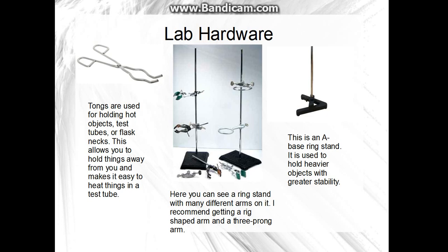Now onto the hardware. You need a pair of tongs — they're used for holding hot objects or test tubes over an open flame to heat things. You need a ring stand; two is better than one, but I only have one. You'll also need arms for it — I prefer just the ring arm. You can also get a two-prong or three-prong arm. An A-base ring stand is used for heavy things or things you really don't want to tip over.